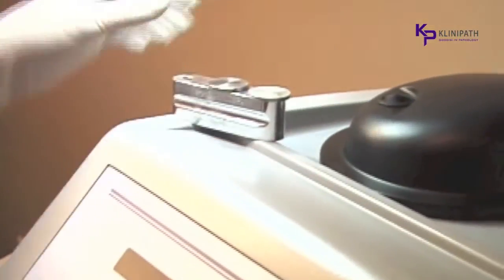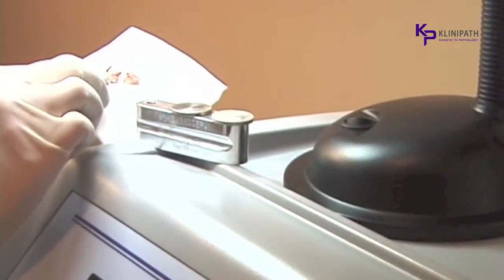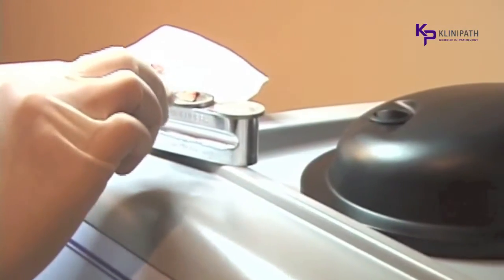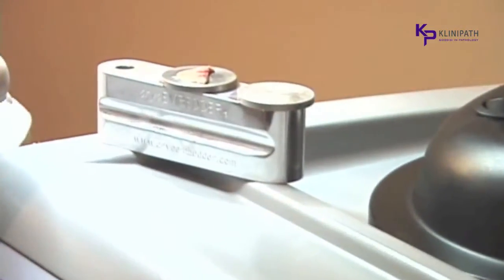Often specimens need to be bisected. With the Cryoembedder, more than one specimen can be oriented and frozen simultaneously. Simply place two or even three flat discs on the embedding device and freeze the samples at the same time.